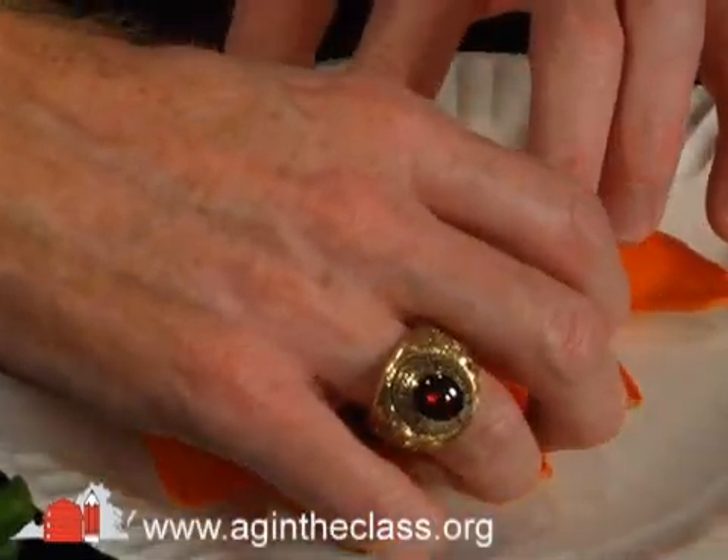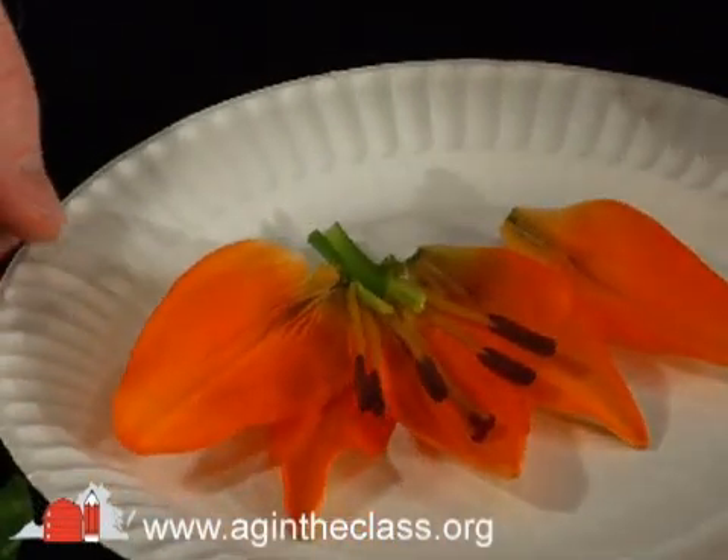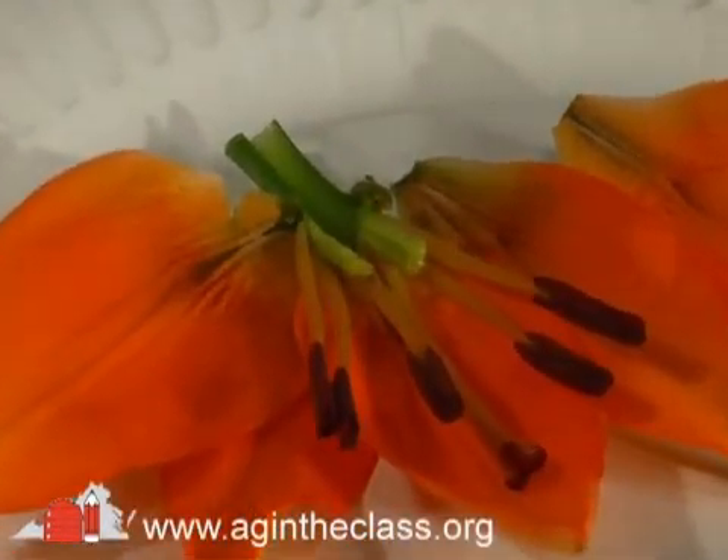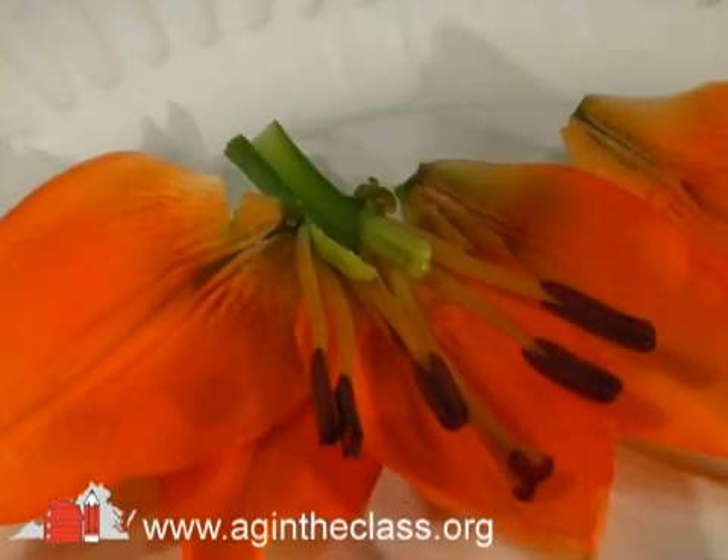What we want to do is get inside there so we can see those ovules inside the ovary. So often in textbook images, that's what we see — the flower split open like that with all the parts labeled. But by having an actual flower there, we're going to be able to see all that.